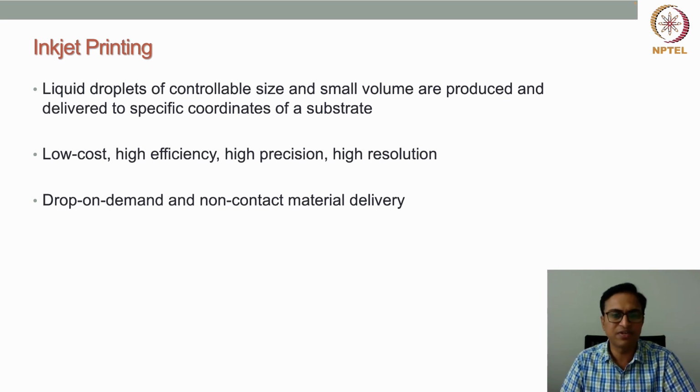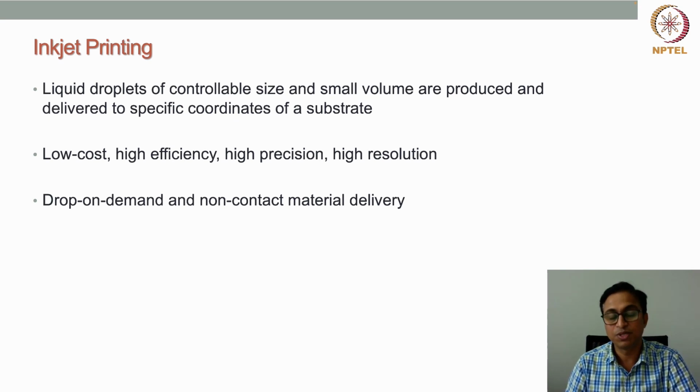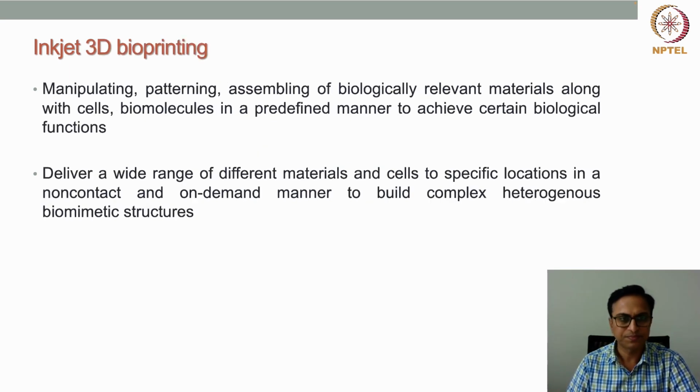It has huge advantages for printing cells, printing pharmaceutical formulations, and also printing other things where, due to contact, there can be contamination. That can be avoided because of this non-contact phenomenon. So this is a very good property for cell printing, because we can reduce the contamination using this kind of inkjet printing technology.